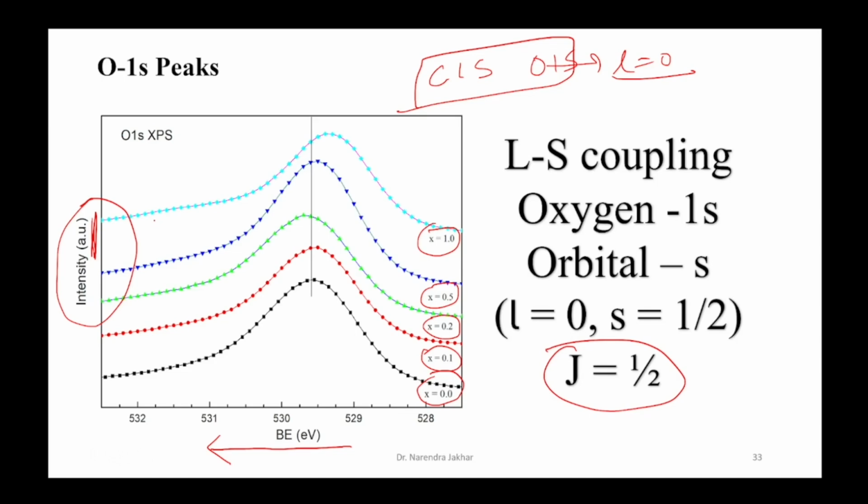So we are going to report our data as atomic concentration, meaning percentage atomic concentration: how much is the Ca, how much is the Cu, how much is the Ti, and so on. So we are using only the arbitrary units of the intensities here.